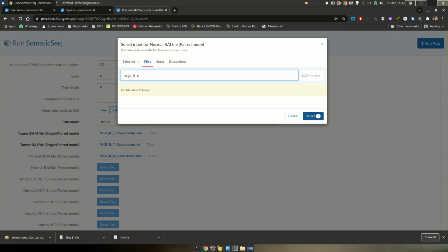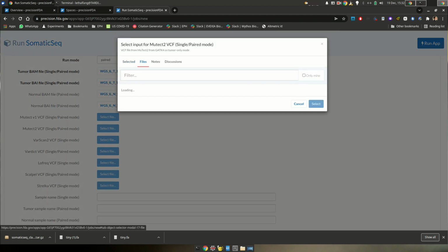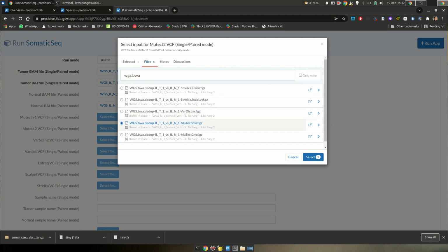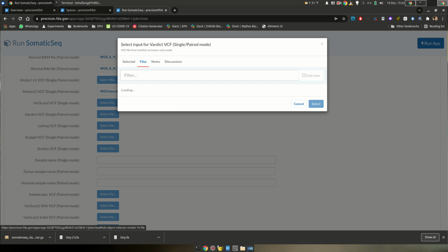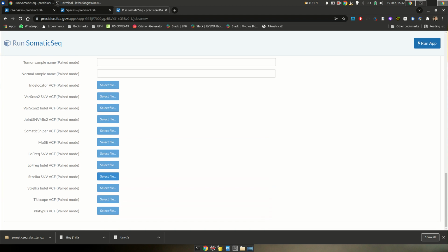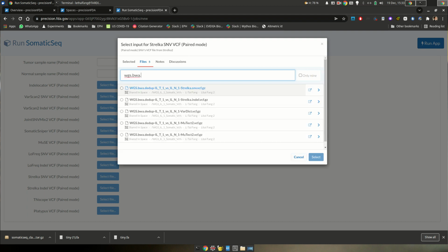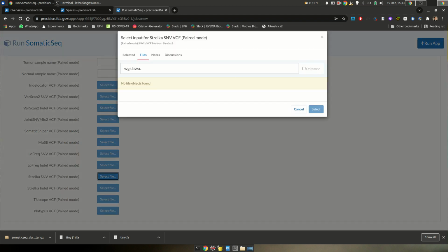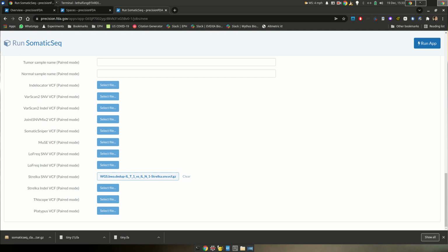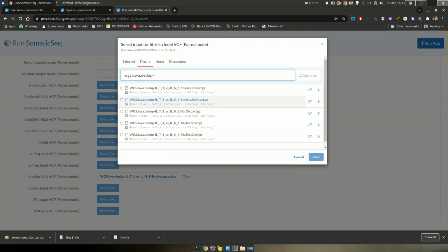Oh, didn't click fast enough. I should be okay. BAM, paired. So MuTect2 again. It's WGS, BWA, I believe. I clicked it. And VarDict, it's WGS BWA. VarDict, can I click? VarDict, yes, it's here. Remember, it's Strelka. WGS BWA, and it's SNV. Got it. WGS BWA dedupe. I want indel.